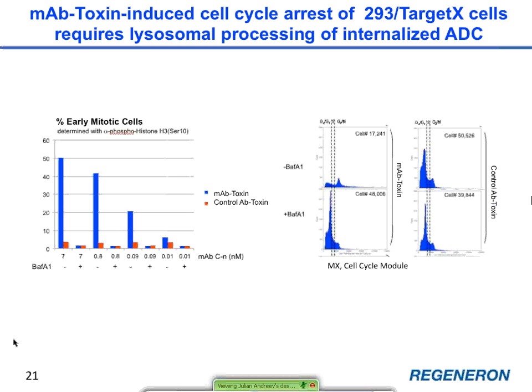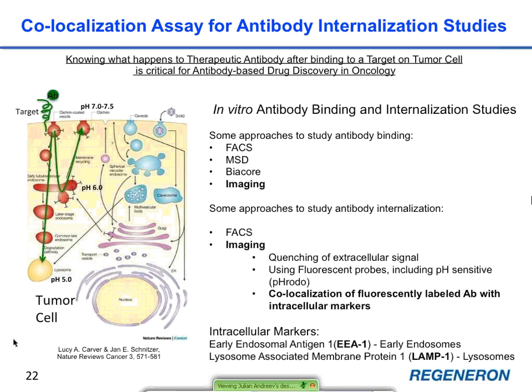And that indicates in itself that lysosomal processing is required to induce cell cycle arrest by this particular antibody under consideration. So that's pretty much how we use our tools to study intracellular trafficking of ADCs. Now, let me switch a little bit to yet another approach to study ADC trafficking, and that is direct visualization and quantitation of binding and internalization of antibodies.